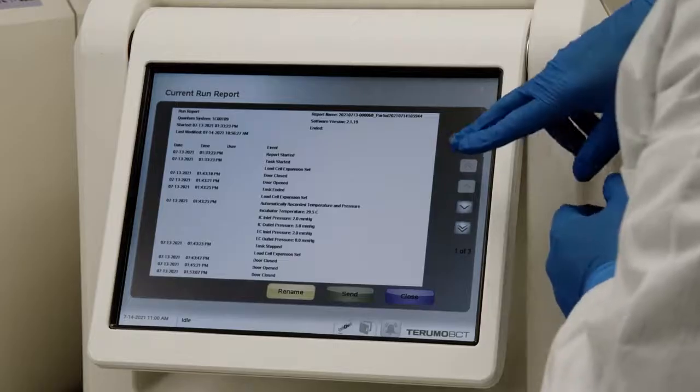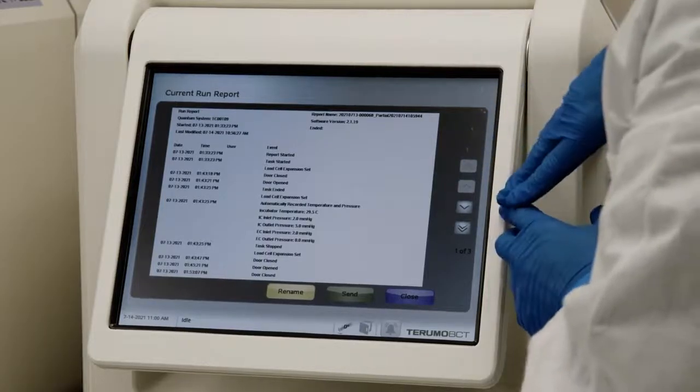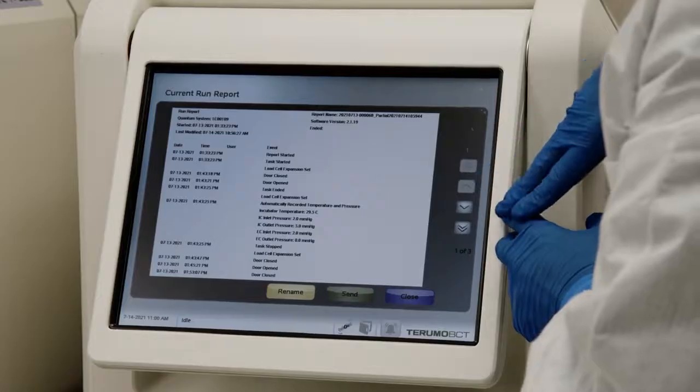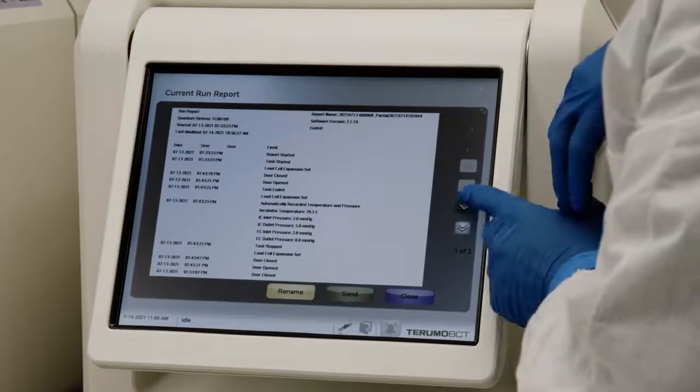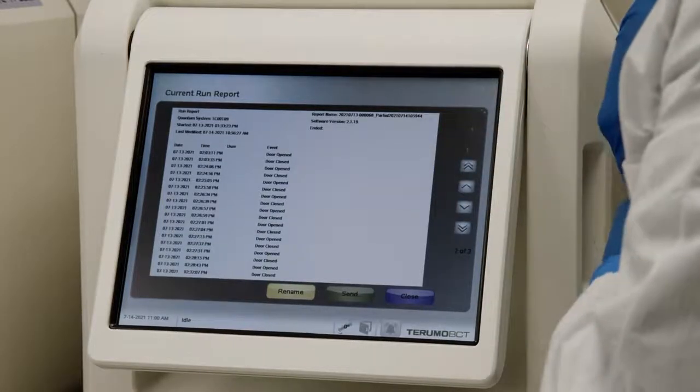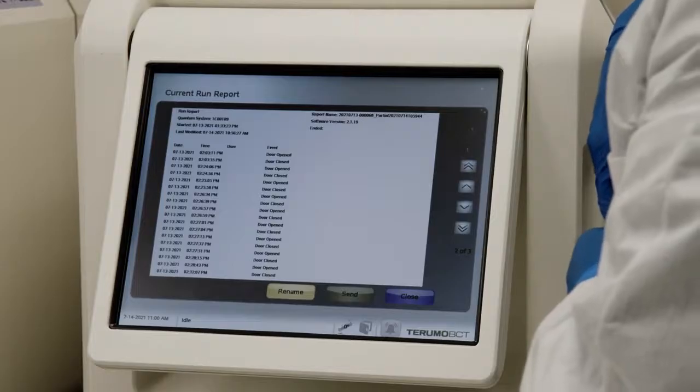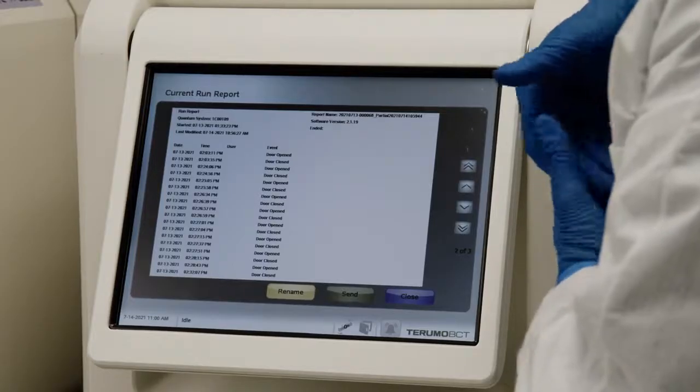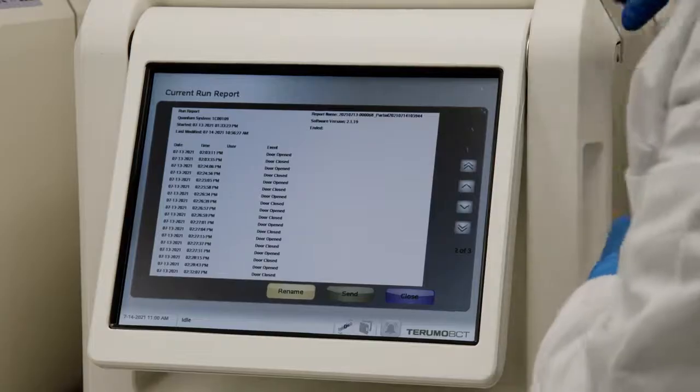This run report contains all information about a single run, including each task that was performed and any modification, any alarms, and all sign-in errors that occur during the run. You can also view stored runs here. If you're not an administrator however, you can only view them and not edit any of these reports.